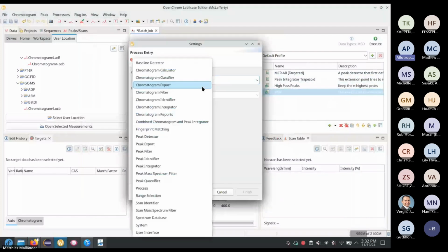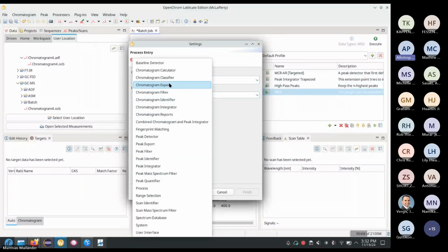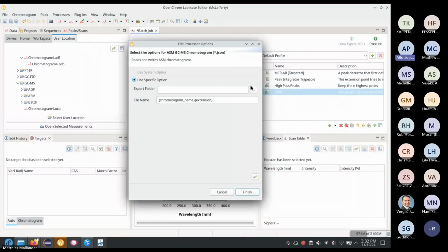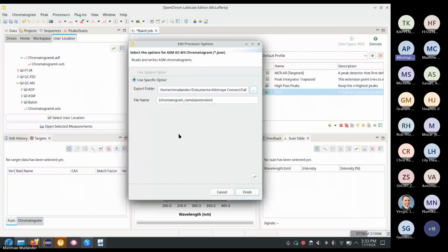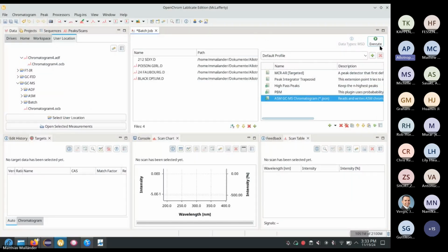And of course, now the most important step, we do something proper here. We export it, and now let's go for ASM, because I know you want. And so let's make science reproducible again, and it doesn't have to be that hard. So, okay, I configured this.